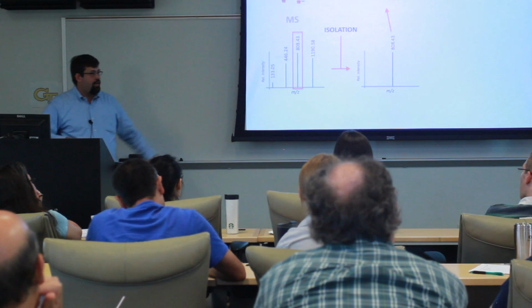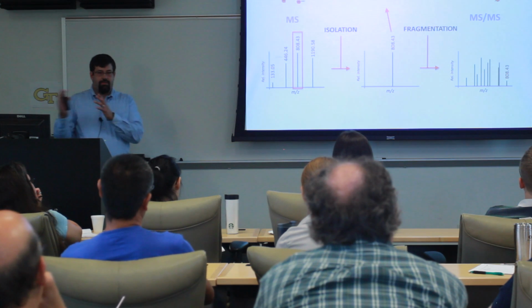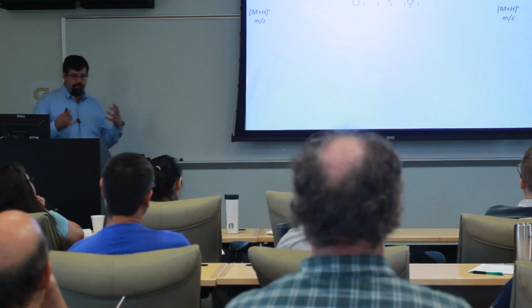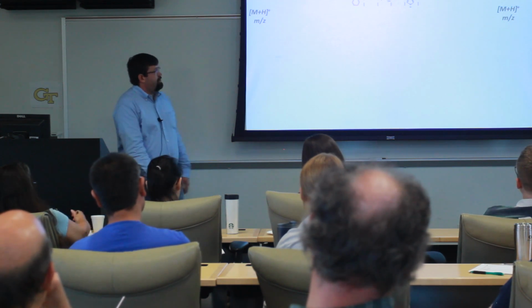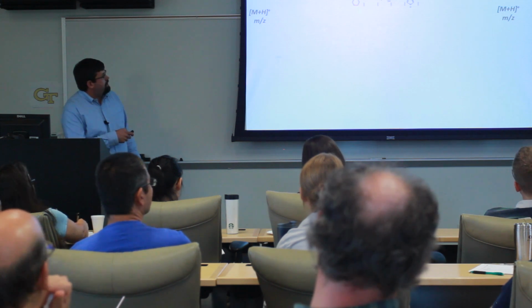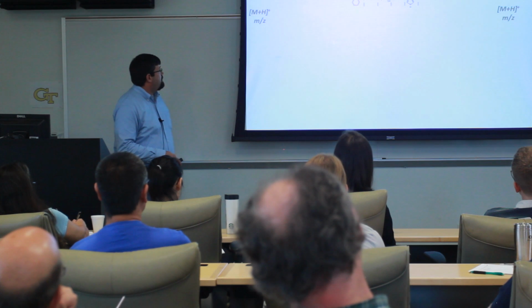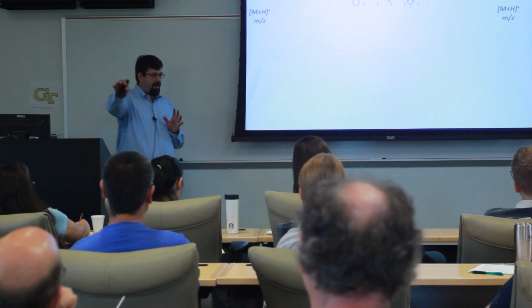Once that's isolated, we can fragment it. Fragment that peptide into its corresponding fragments. Now, how does that work? So the basic concept and the most common mechanism for fragmentation for proteomics and peptides is collision-induced dissociation or collision-activated dissociation. So say we have this peptide FYTLHK, right? Peptide bonds indicated between each of these residues. We know, of course, each one of these residues is a specific mass. We isolate this peptide, and then we fragment and scan out the fragments to the detector.